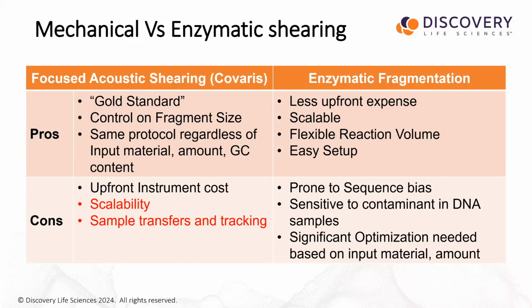However, on the other side, enzymatic fragmentation does provide a less upfront expense. To some extent, it is scalable. We can come to that. And it provides flexible reaction volumes, easy setup, things like that. But what we have to consider is what we are getting out of it, with both the technologies.